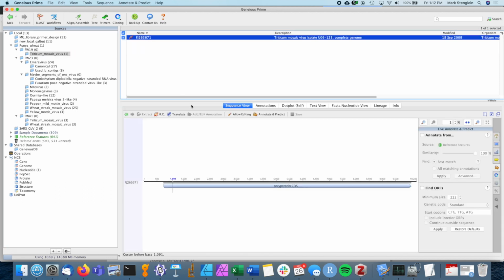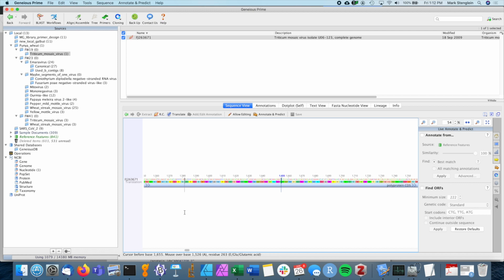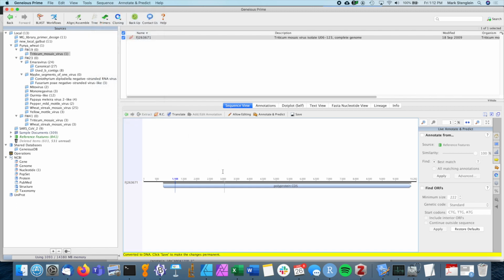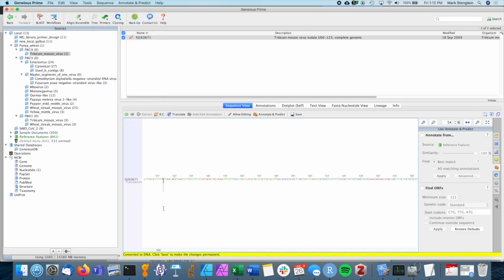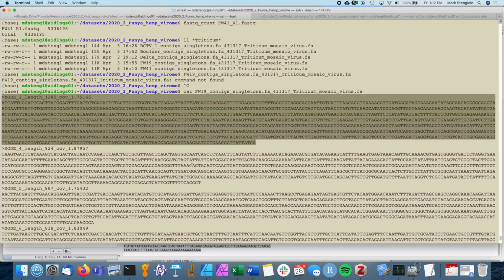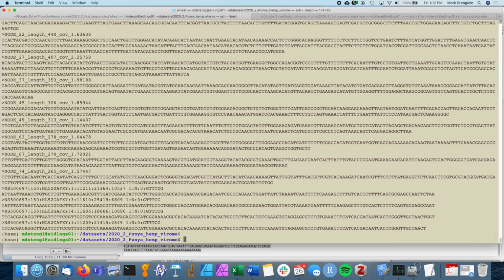All right. One thing you'll notice is that because this is an RNA virus, this is presented as an RNA sequence. It has U's instead of T's. I'm going to convert those to DNA. Because we're virologists, we know that in the genomic RNA those are U's and not T's, but for the purposes of using these bioinformatics tools, sometimes it's easier to just keep everything as DNA sequences, because the Illumina sequences we're using are also DNA sequences. We converted the RNA to DNA in library prep. So here we'll be comparing DNA sequences to DNA sequences.